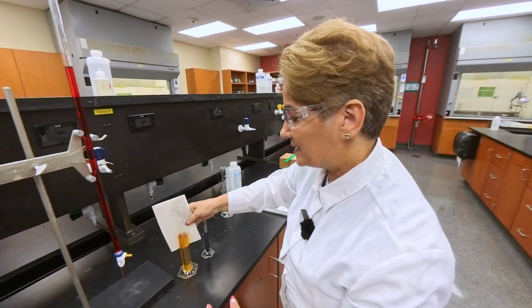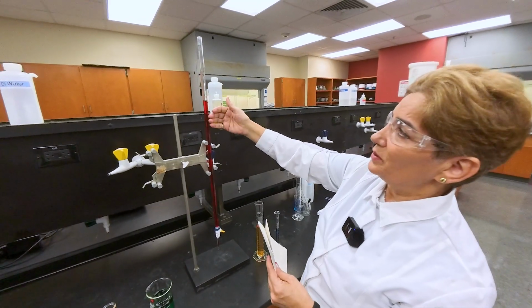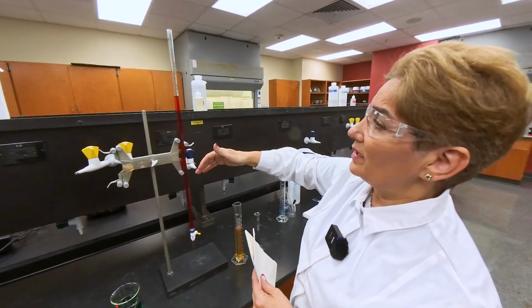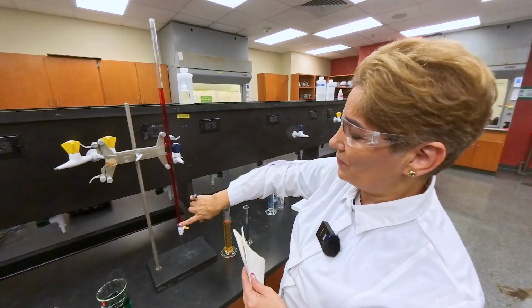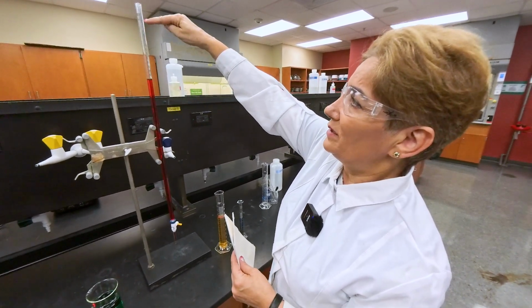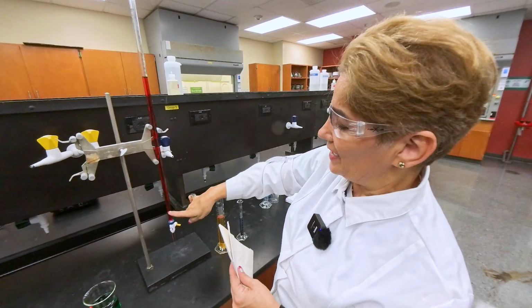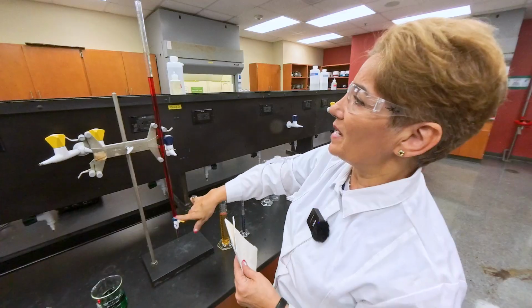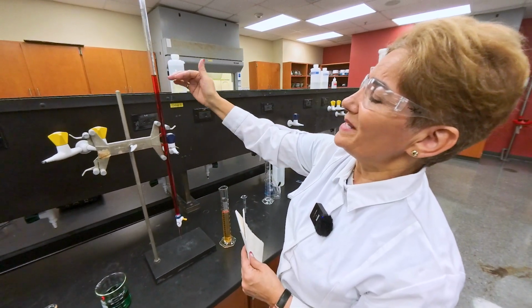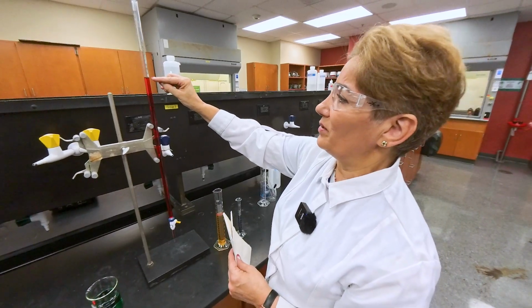Next one is measuring volume, or basically the reading in the burette. Why do we call this the reading in the burette, not volume? Because we are not counting how much liquid is here. These numbers increase from top down, from 0, and go down to about 50 here, and then the numbers stop. So when we are reading the burette, we are basically expressing the level of the liquid.